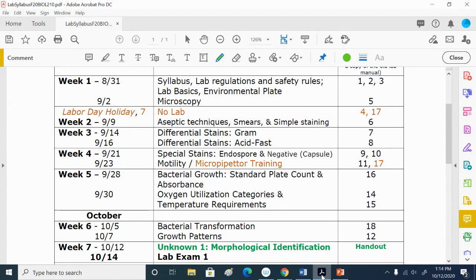Anywhere. Right. Everywhere, right? So that's something you always have to keep in mind as you are working in the lab. The contamination can come from anywhere, so you got to be really careful, right? And when you were looking at the plates, at the different environmental plate results, could you tell that there was more than one kind of microorganism growing on those plates?